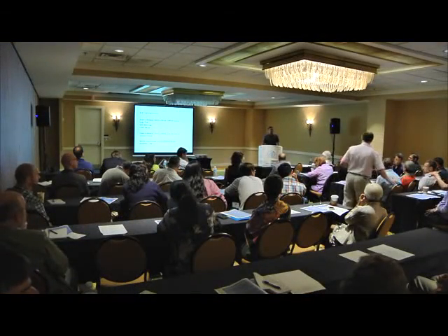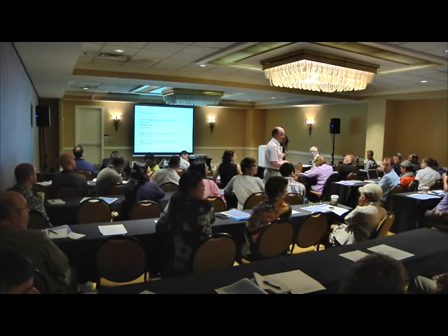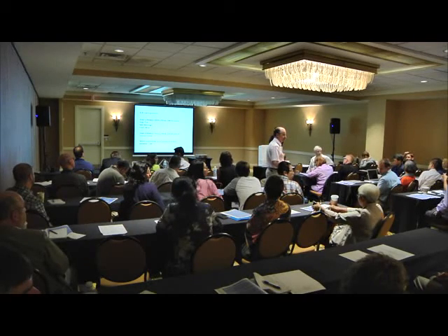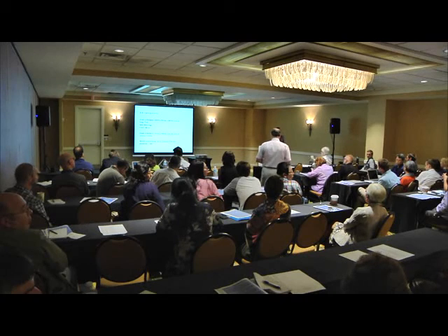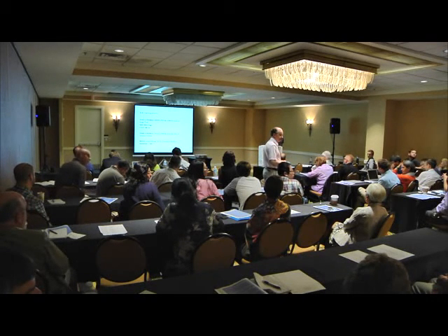Very elegant work. I have two questions. The first one, do you have to use high resolution mass spec, or how many significant figures do you have to have for your model? And the second question, is there any way to extract information regarding double bond location on acyl chains?